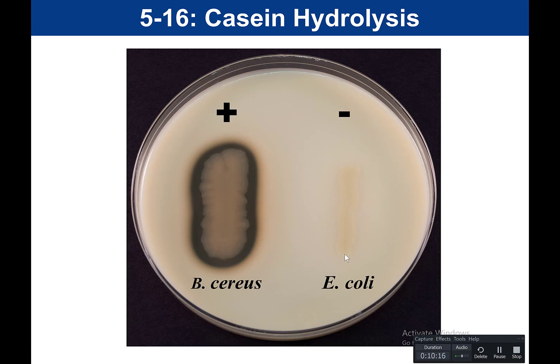In this test there is no pH indicator and no reagent. It's simply a readout of substrate and products: the substrate is intact casein making the milk cloudy, and the products — polypeptides and amino acids — result in the agar becoming clear. Positive: clear zone around growth. Negative: cloudy milk remains. That is the casein hydrolysis test.